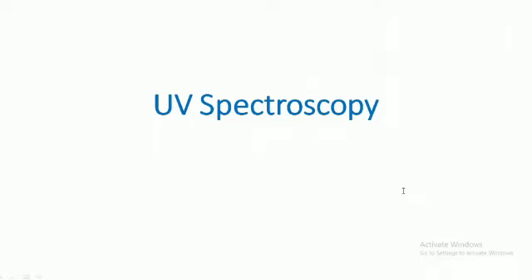So today we'll take up the first and foremost topic in spectroscopy, which is very important and is one of the most basic techniques used in any of the analytical laboratories. It also makes use of electromagnetic radiation for its working, and we'll see how we can exploit this technique to obtain fruitful results, the experimental data which will prove what our sample or our analysis is.